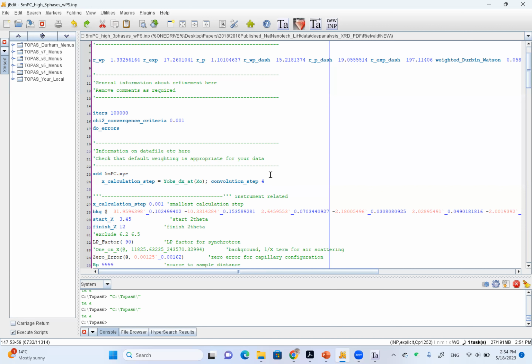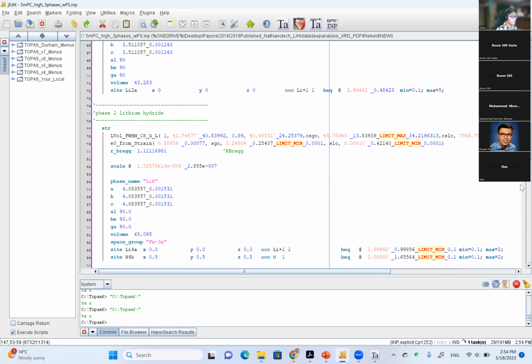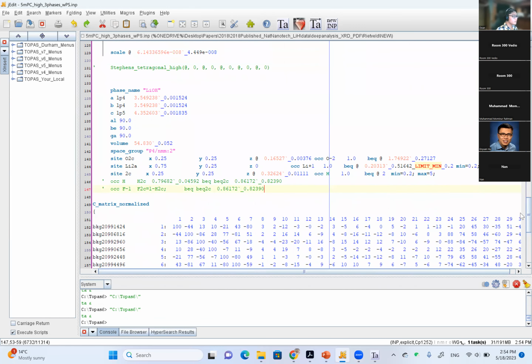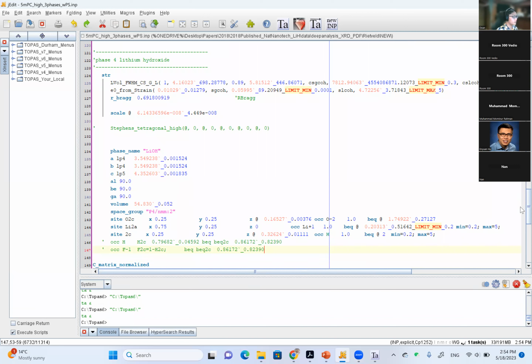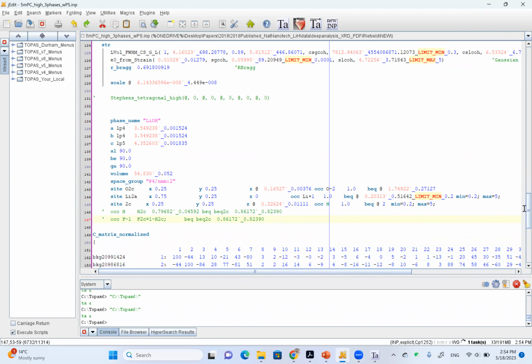Oh, the dummy phase. Did we have a dummy phase in this info file? We didn't, right? No, you just mentioned this before. In your case, I think we mentioned the dummy phase, but it was not included in this info file. So yeah, dummy phase is okay. This is beyond what I was planning to share today.